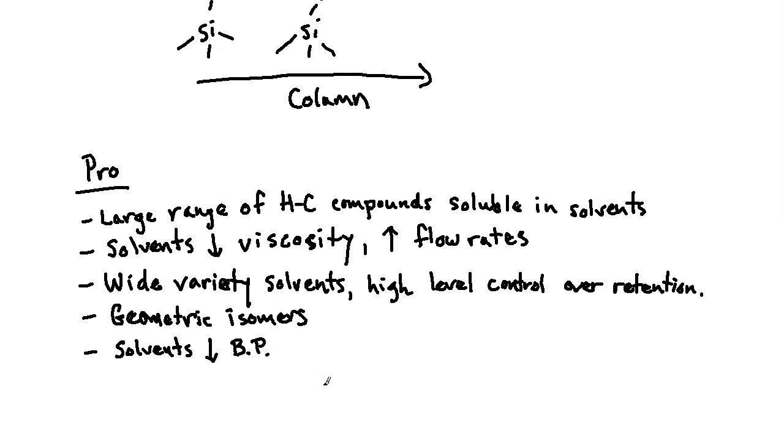And if you have solvents that have lower boiling points, they are usually going to be easier to recover. And that's important because when you talk about green chemistry, especially with these solvents that potentially are going to be damaging to the environment, damaging to the wallet, produce a lot of waste, you want to be able to recover them with a low boiling point to utilize them over and over again.